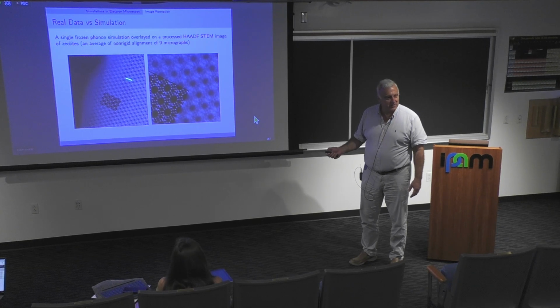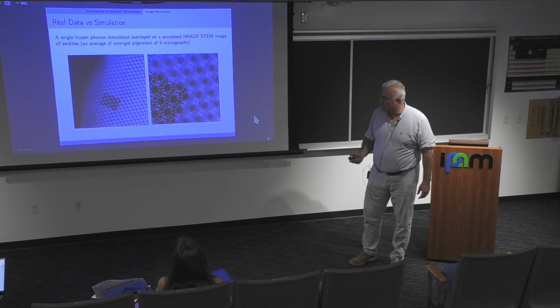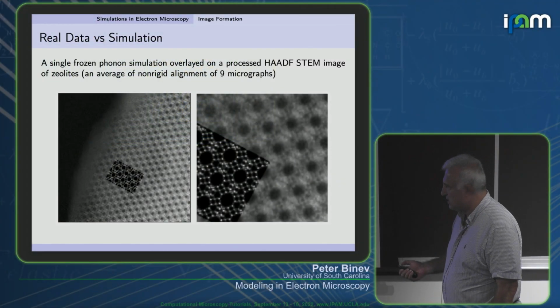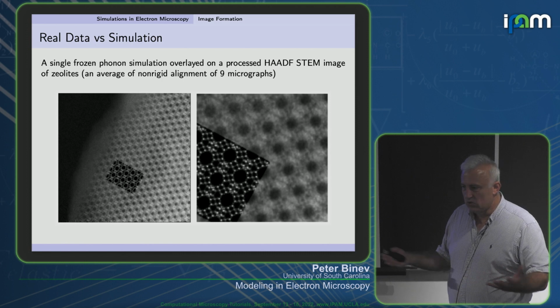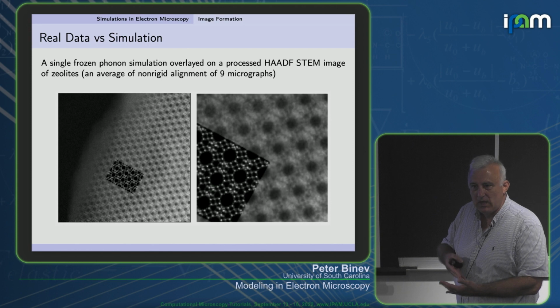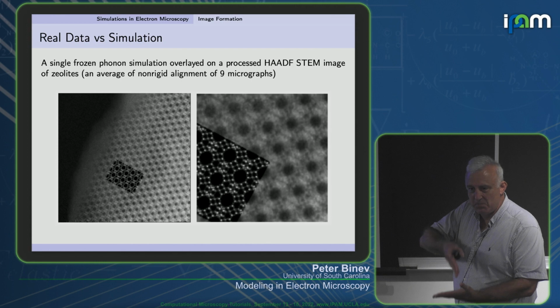This is the centers of the atoms. So how that looks like seems relatively the same. Why I want to mention something else is because here there is something from the modeling we are using. This is the position distortion. During the scanning process, the positions at which we assume the beam is are not exactly the same.